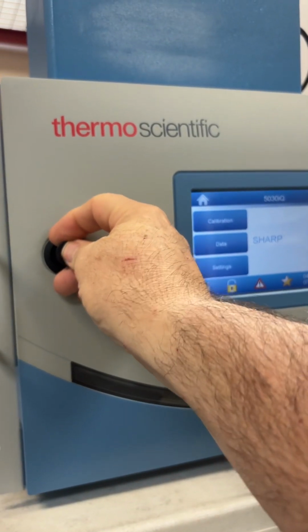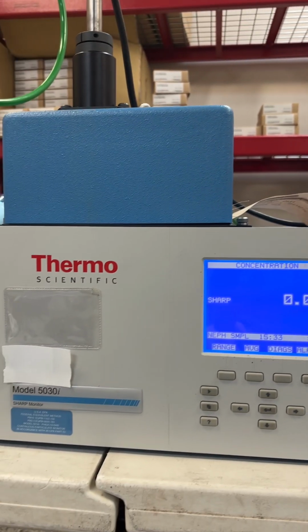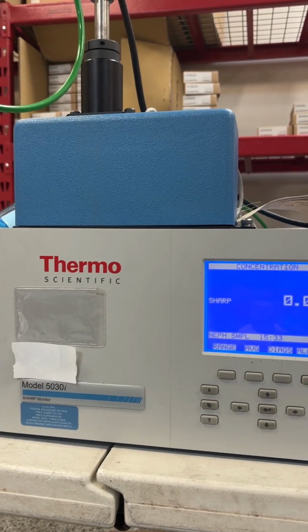So that is the 5030 IQ. This is the 5030i. And that is the Sharp Thermo Scientific.